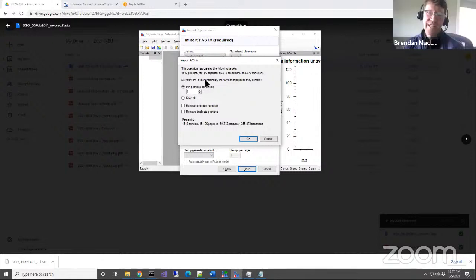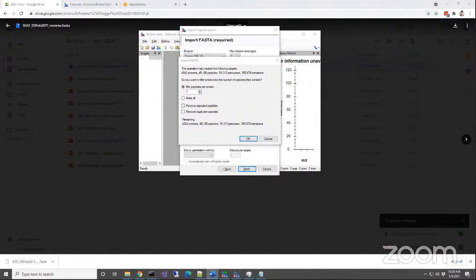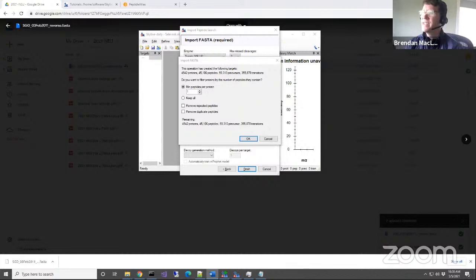So here we get something where we get to make some choices. It turns out that this is not a good time to make these choices, and we're going to fix this too. After trying this myself, I realized that when you're using a pre-built library, it's not a good time because we don't actually have our iRT model hooked up yet. Making some of these choices at this point is going to cause us problems later.